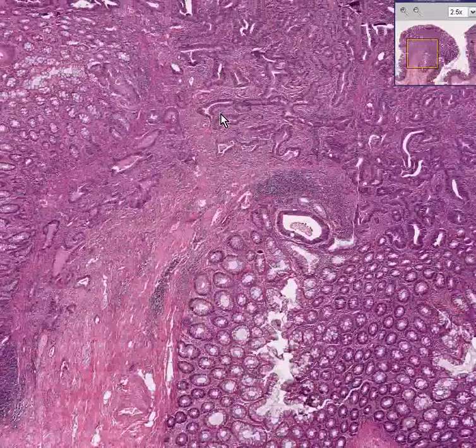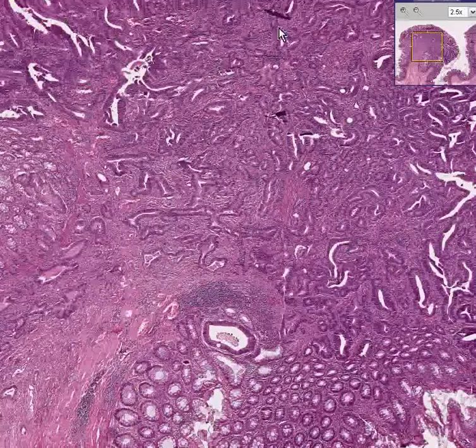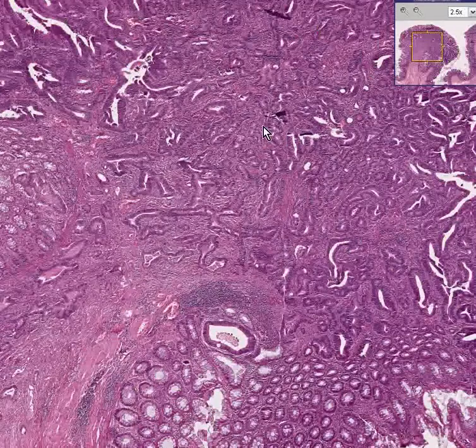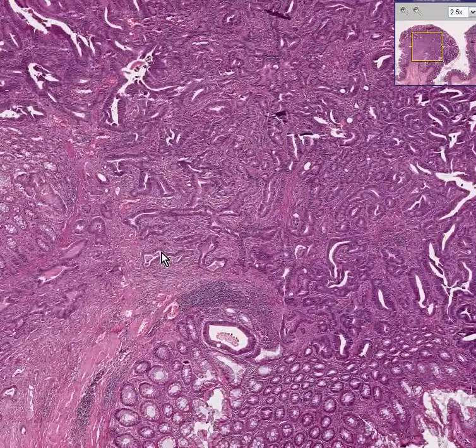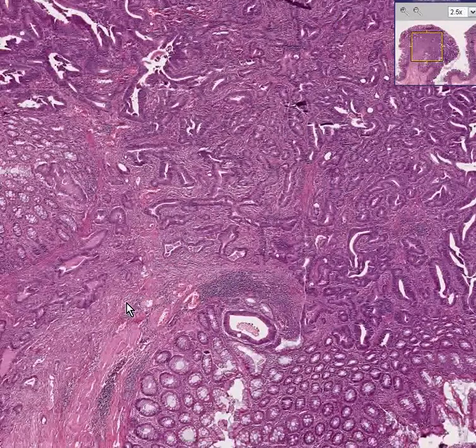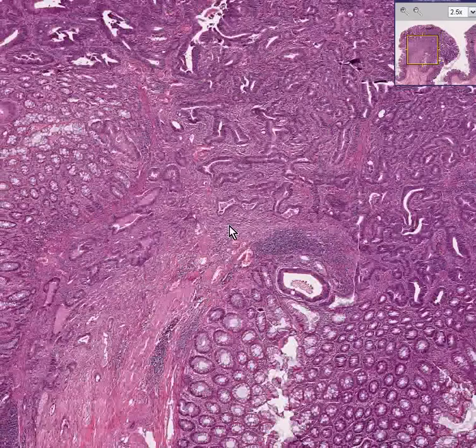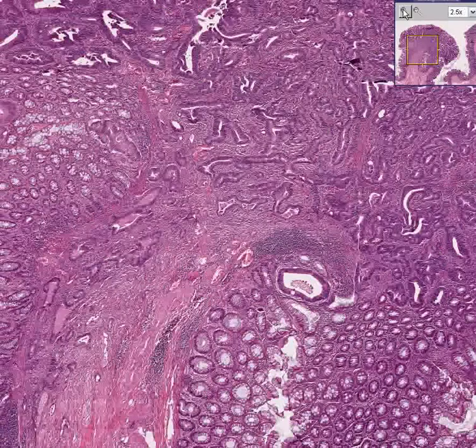This one did turn into cancer, and by the time you know that this is the polyp over here, some of these glands of the polyp have decided to invade into the connective tissue of the stalk.